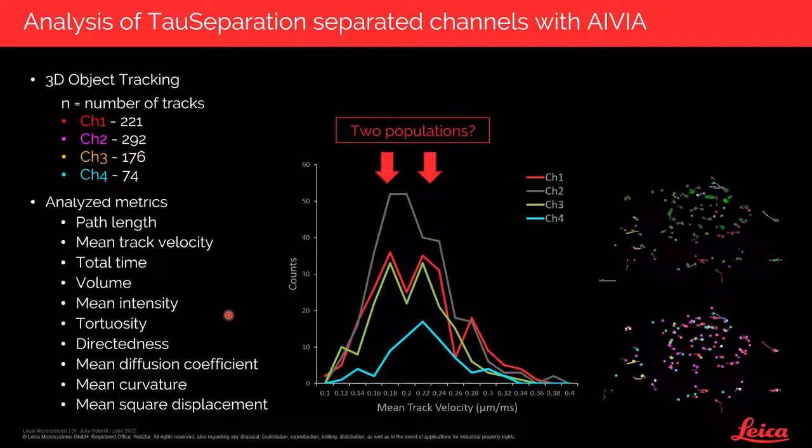So with these metrics, we can now put numbers to the behavior of the vesicles in different functional states, and this could, for example, serve as criteria to compare how the process is affected upon external perturbations, upon stress, and integrating information coming, for example, from experiments where we address up and down regulation of signaling proteins.